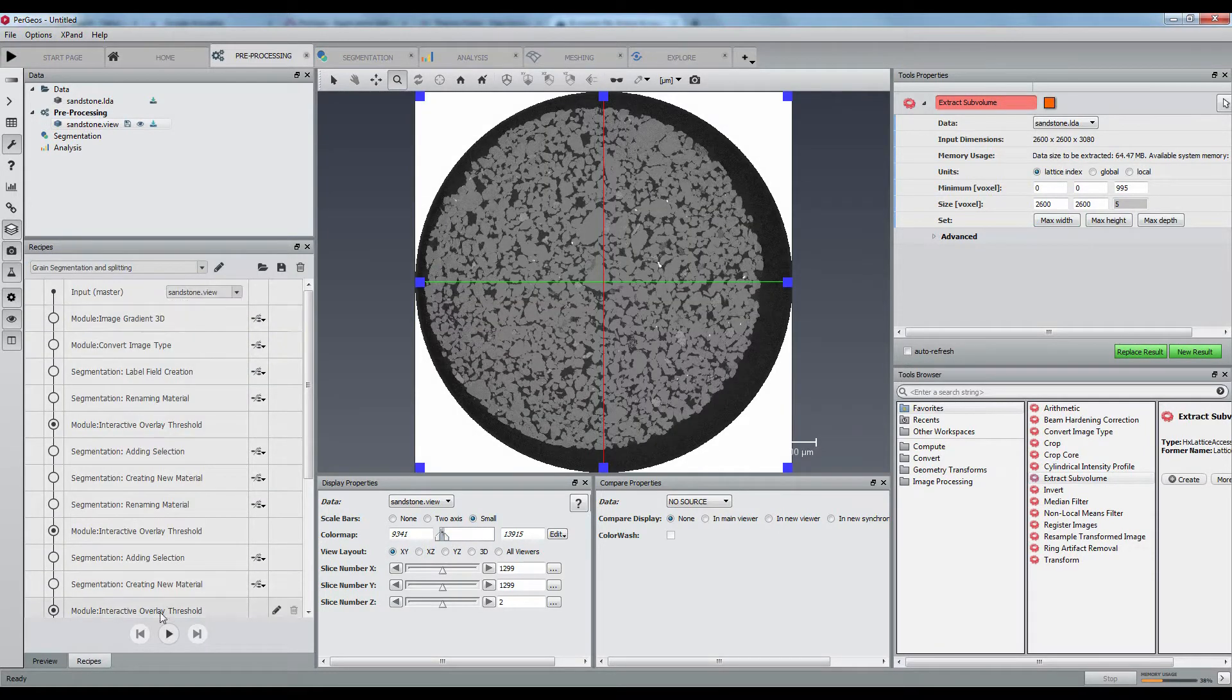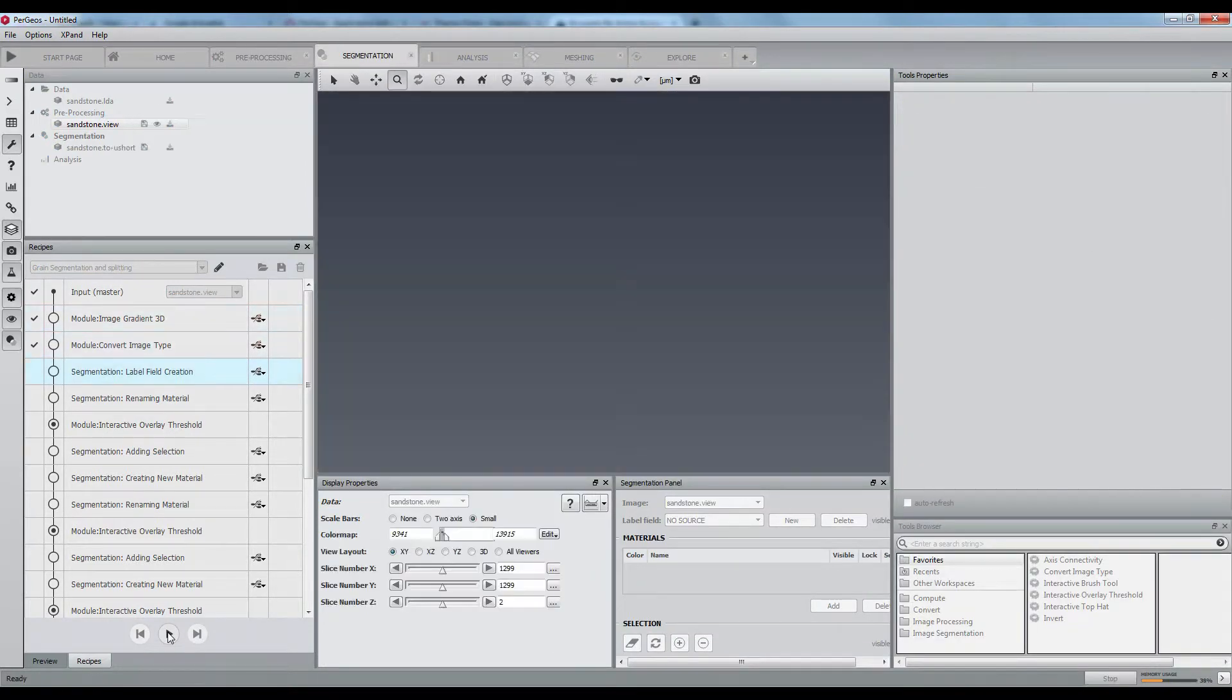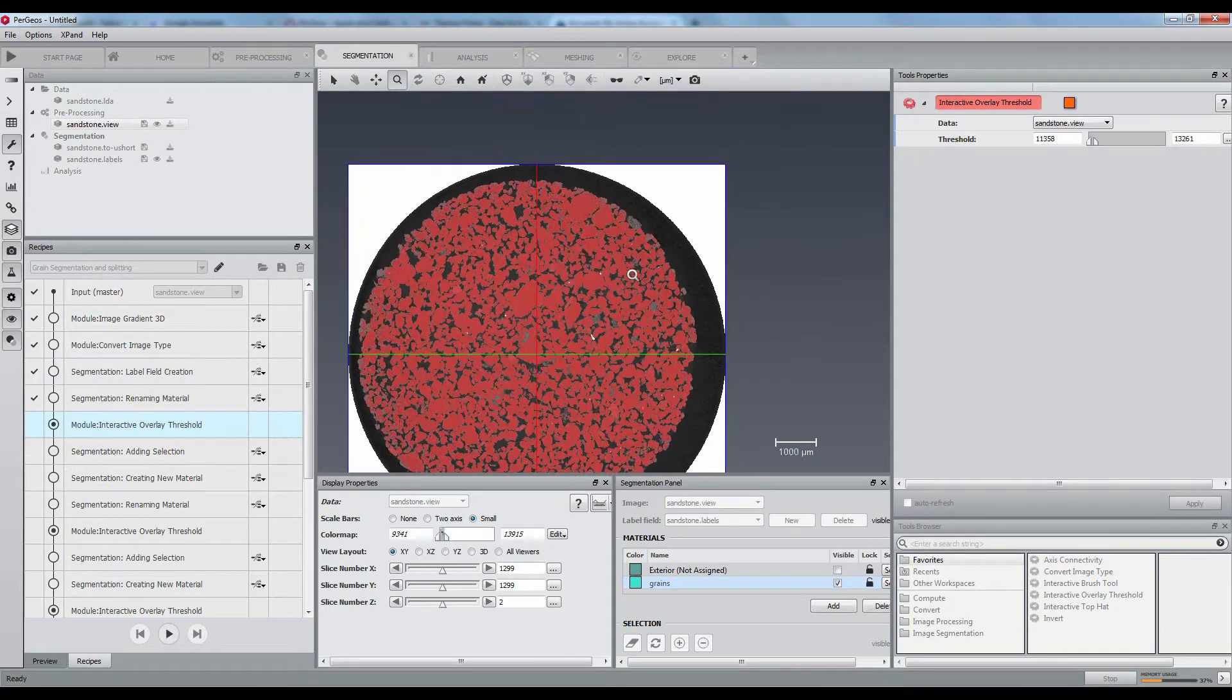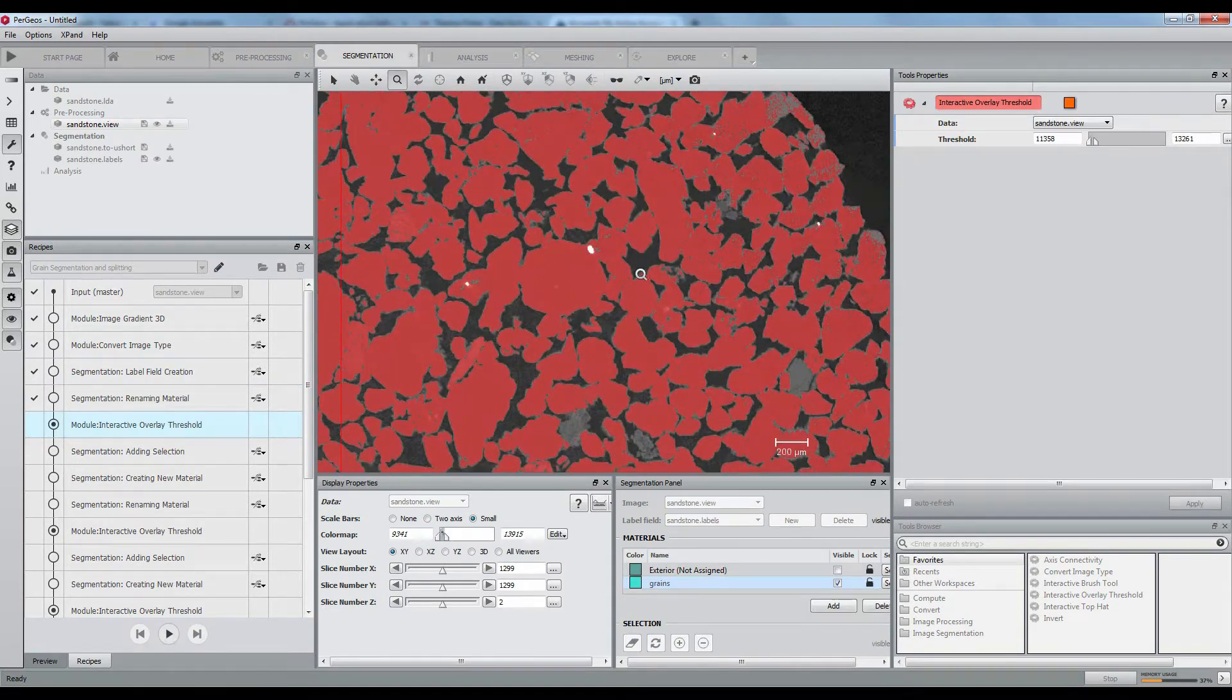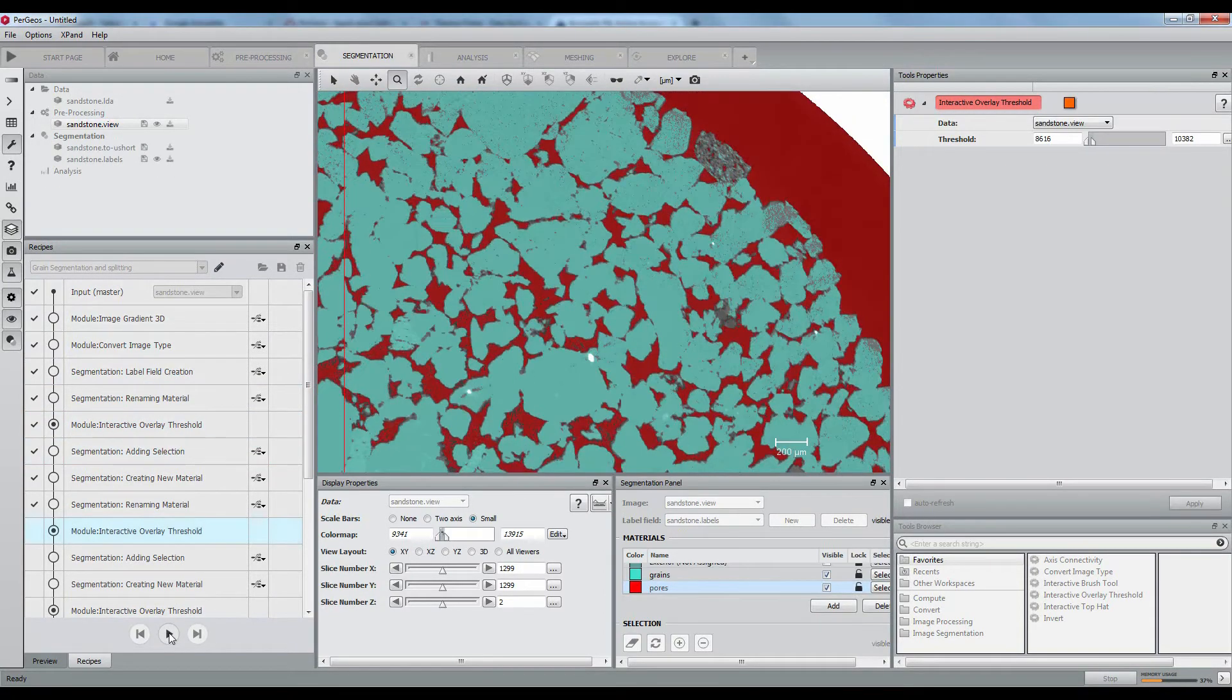This custom recipe will be responsible to segment the grains with a marker-based watershed by marking two phases with thresholding and enhancing the inter-granular space with a black top hat.